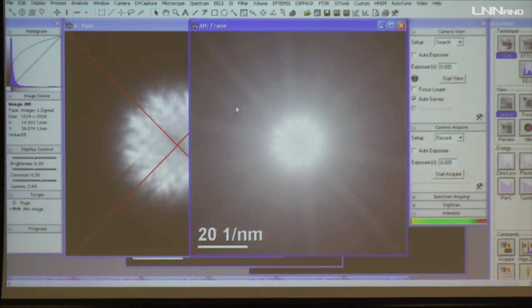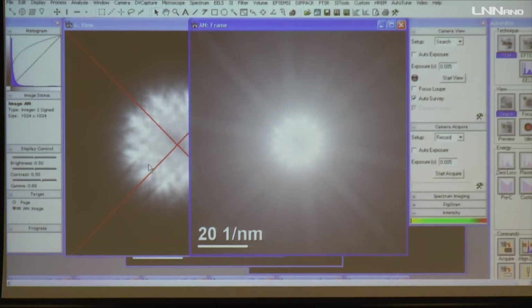These are called, as you know, Kikuchi lines. This is the central transmitted disk, and I said this is our 002, and this is our 220. Using this, we can construct our own Kikuchi maps, or if you have any electron microscopy software, we can easily simulate the maps.